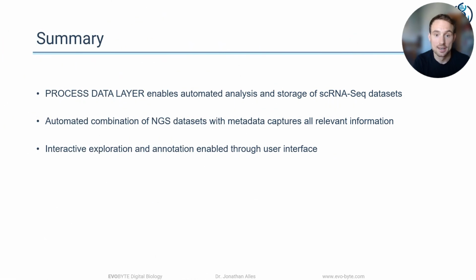After this live demo, I would like to summarize the first part of this webinar. So we've seen how we can go from a laboratory process for a single-cell RNA-Seq workflow on blood cells to a concept for a process data layer that is able to capture and store all relevant information and data that are produced by the research process.